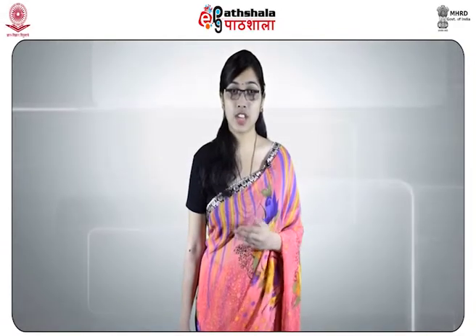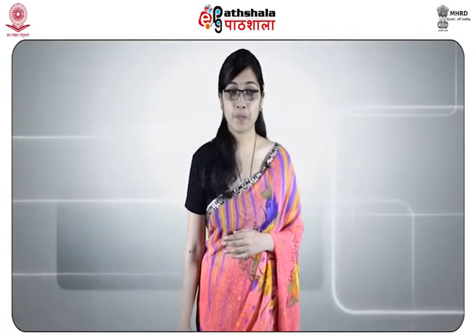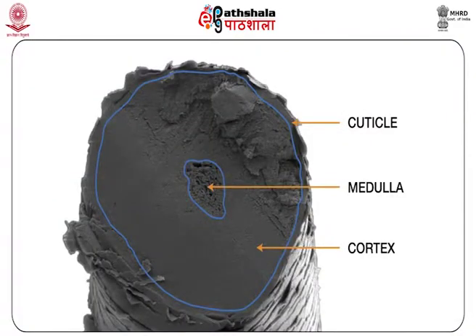Next, we will study microtomy. The cross sections of hairs are obtained with the help of an instrument called the microtome. Clean hair is embedded in hard wax, plastics or flesh hardened by special treatment, and sliced.